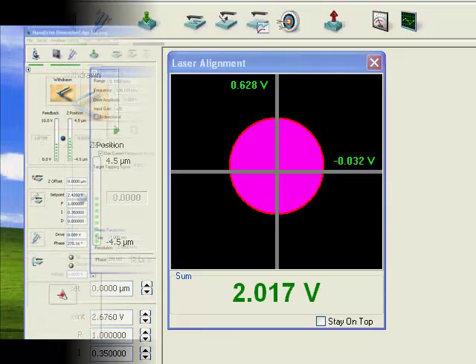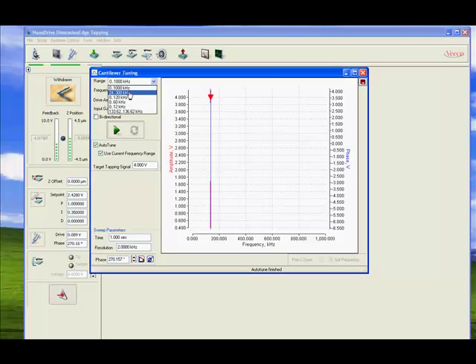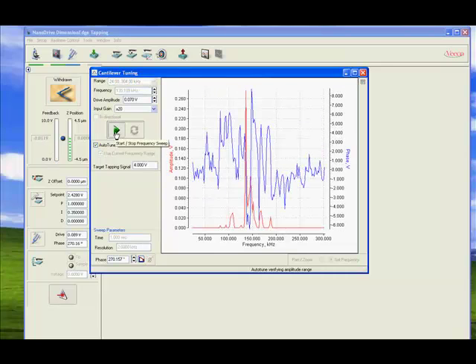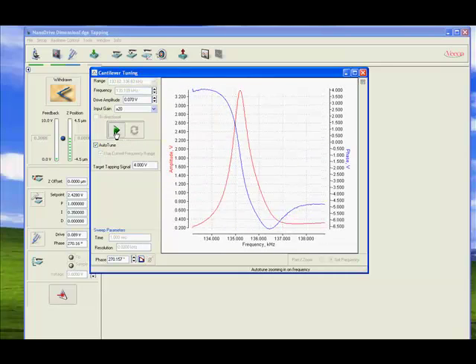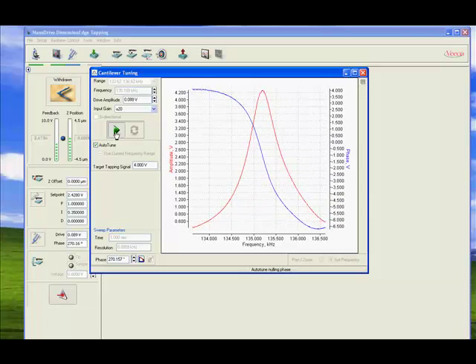Now we can close that window and start the tuning dialog for the cantilever, where we want to find the resonance frequency. The system is going to do that automatically for us, select the proper cantilever oscillation amplitude, and set the corresponding set point for the feedback. Okay, that is done now and we can close that window.